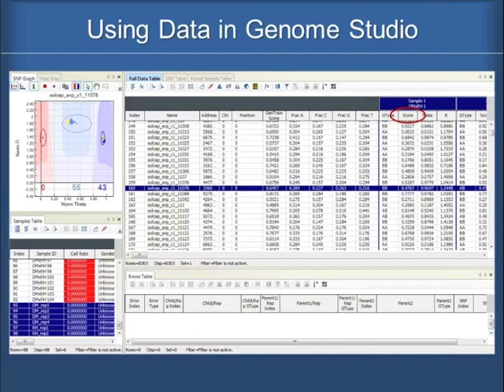If this is our diploid cross, there should be 92 progeny plus the parental lines that continue down to the right that we could scroll over and look at. And then over here, in this column are all the 8,300 different SNPs. So you can highlight a single SNP and look at the data across all the progeny there.